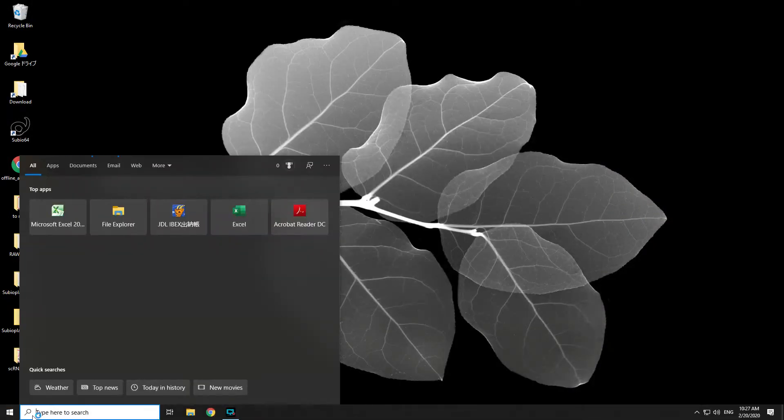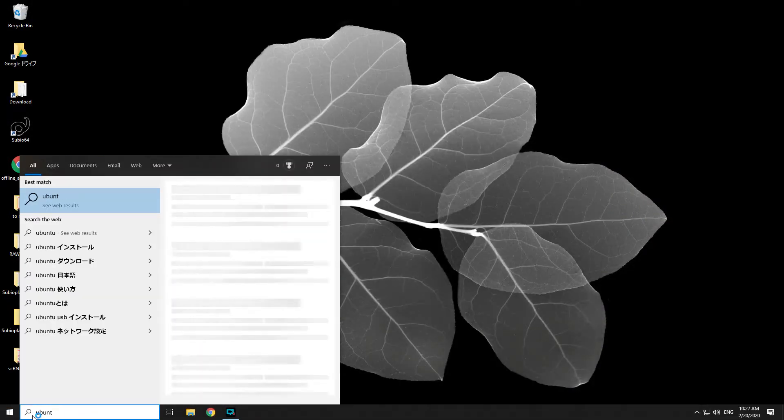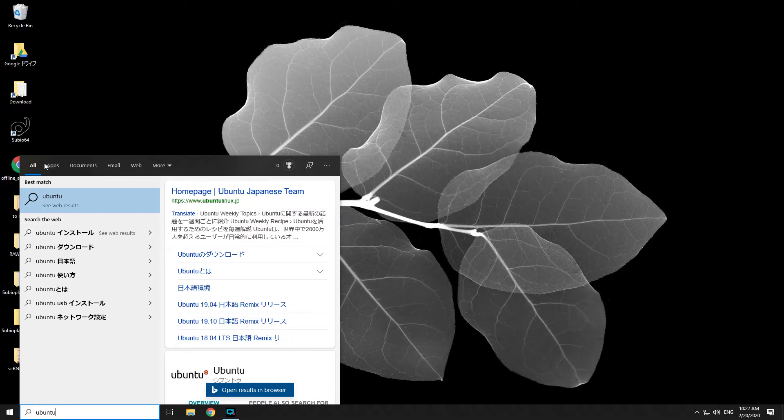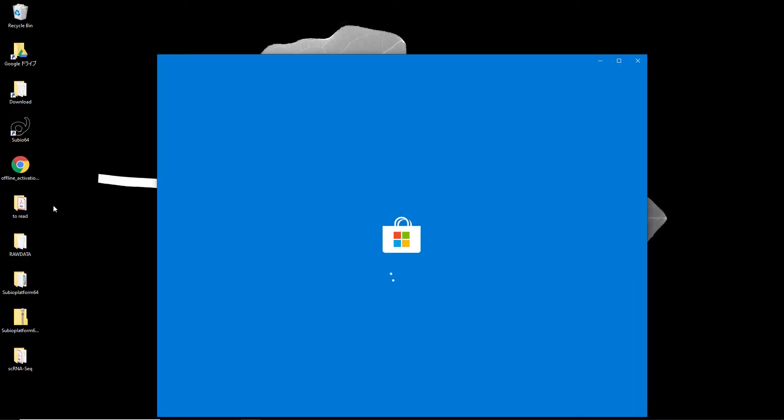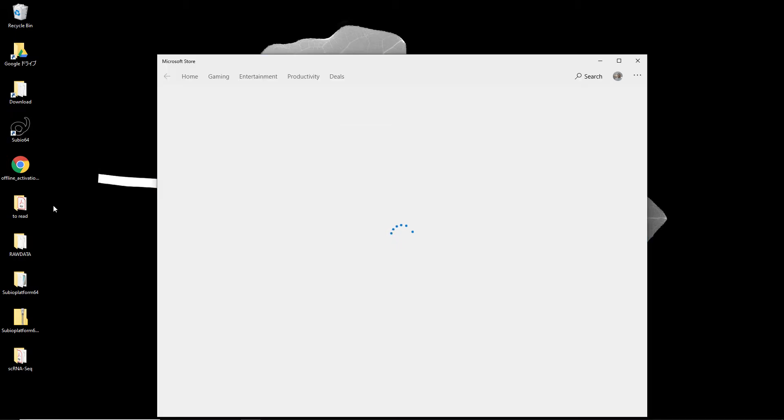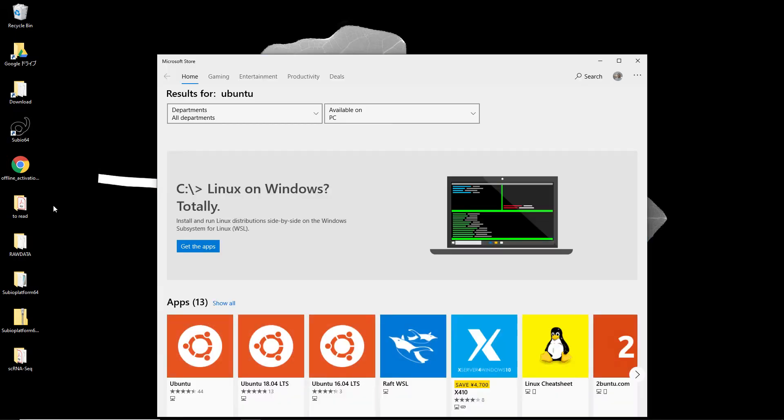Search Ubuntu at the Microsoft App Store. Select Ubuntu and install it.